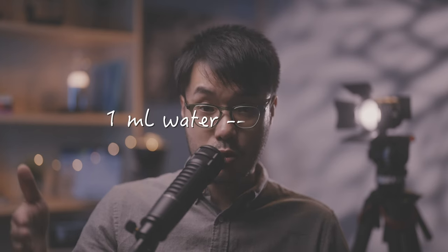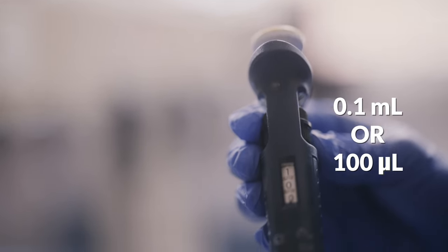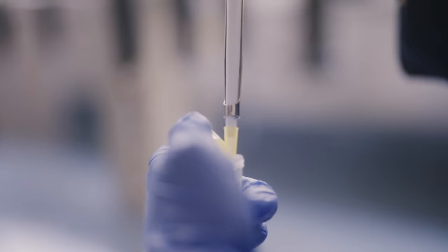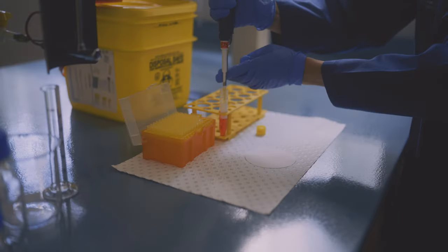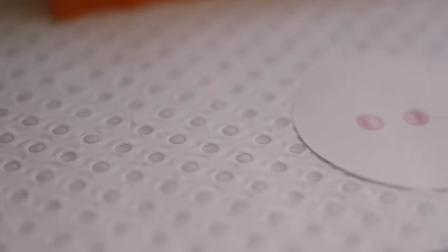Looking back on when I first found out my pipetting technique was deeply flawed, how did I figure out where the inaccuracies were coming from? Like any hands-on skill, it comes down to practice and monitoring your progress over time. One milliliter of water should weigh one gram, and 0.1 mils or 100 microliters of water should weigh 0.1 grams. You can repeatedly pipette the same volume multiple times, weigh it, and then assess the variation of weight across your repeats. It won't be exactly 0.1 grams every time, but you can get a sense of how much the volume varies. A simpler way to do this is to pipette onto filter paper repeatedly and look at the diameter of the liquid droplet diffused onto the paper — it should be consistent in size if you're pipetting the same volume each time. In longer experiments, your hands will get tired, so these exercises will give you a sense of when your accuracy begins to taper off due to fatigue.